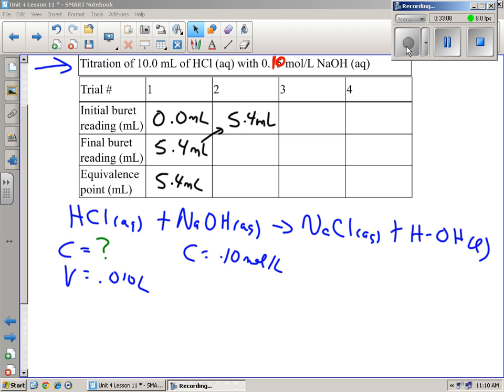Oh, we're getting really close here. Ooh. I probably need that 1 drop. There we go. Oh, okay, so we're really, really close here. We need to go drop by drop. So if you want to stop it at this point and go 1 drop, turn it off, 1 drop, turn it off. Make sure you know which way is off.